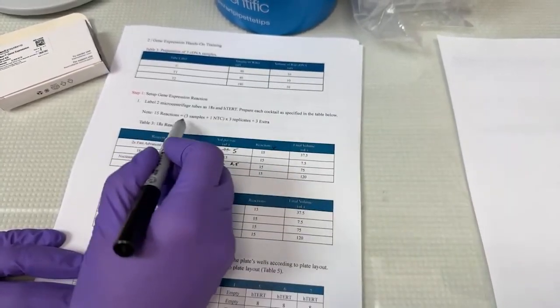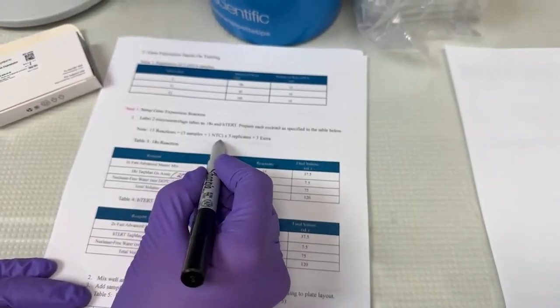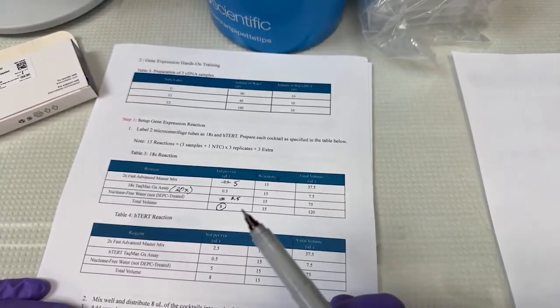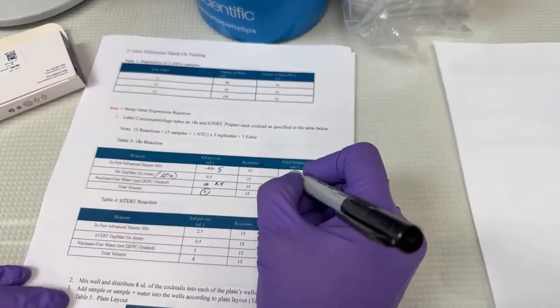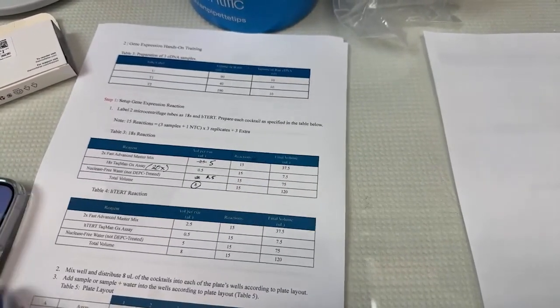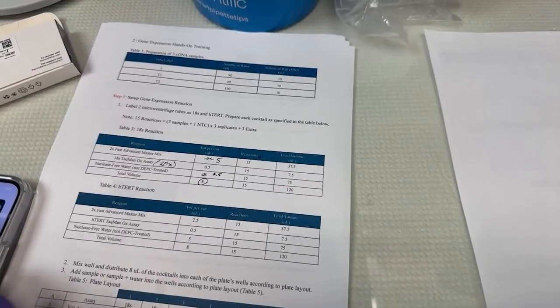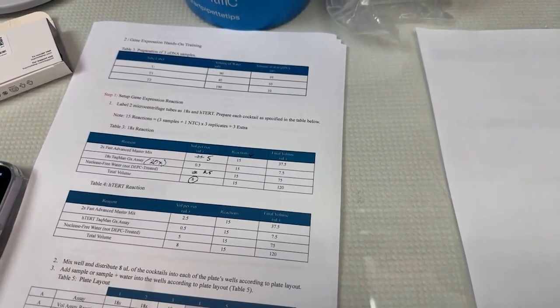This comes from, again, I have 3 samples. I have 1 no template control. I'm going to run each of those 3 times, and I'm going to make a couple of extra. So we run that out, and we get 15. So if we double check our math, those don't look right, so let's fix it. Always have a calculator available when you're in the lab.